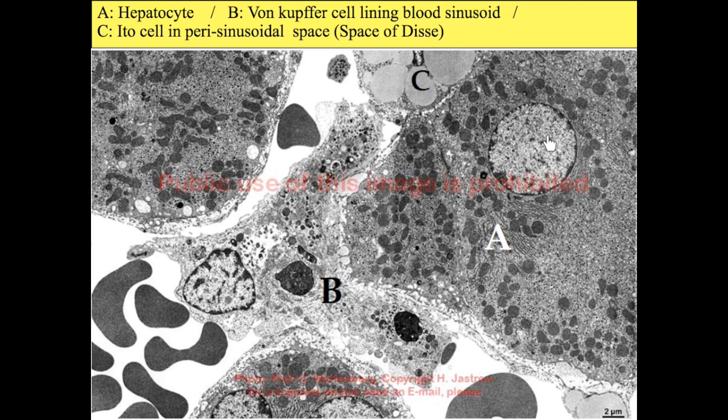Here, the euchromatin is more than the heterochromatin, so this is 100% the nucleus of the liver cell, the hepatocyte. And you will look at it, you will find plenty of mitochondria. Also, we have other organelles, as this will be the rough endoplasmic reticulum near the nucleus, and towards the periphery you can diagnose also smooth endoplasmic reticulum, but it is of a small magnification here.